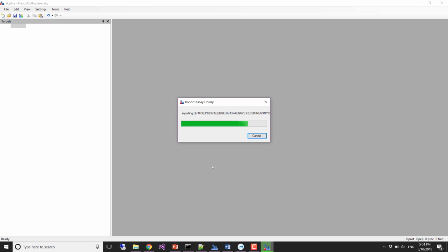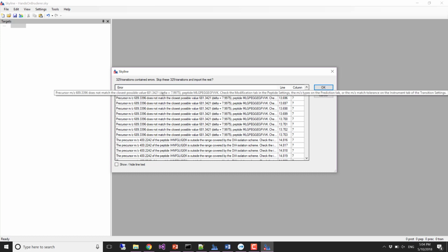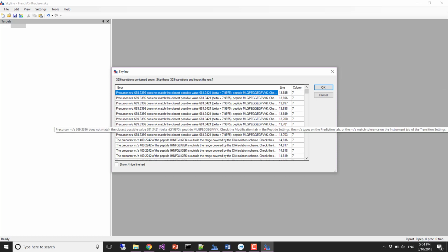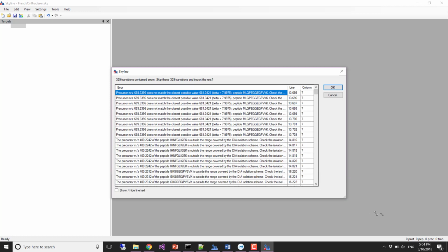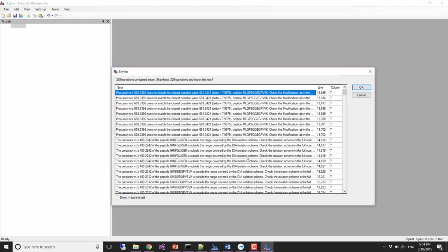All right. Mike, I need a new machine. Okay, I hope you got the right file. Did you get to this 329 errors? Wow, that was fast. Okay, so what are these 329 errors? Well, first of all... 6,000? So you missed some steps. Everybody should get 329. If you didn't, then you missed some steps.